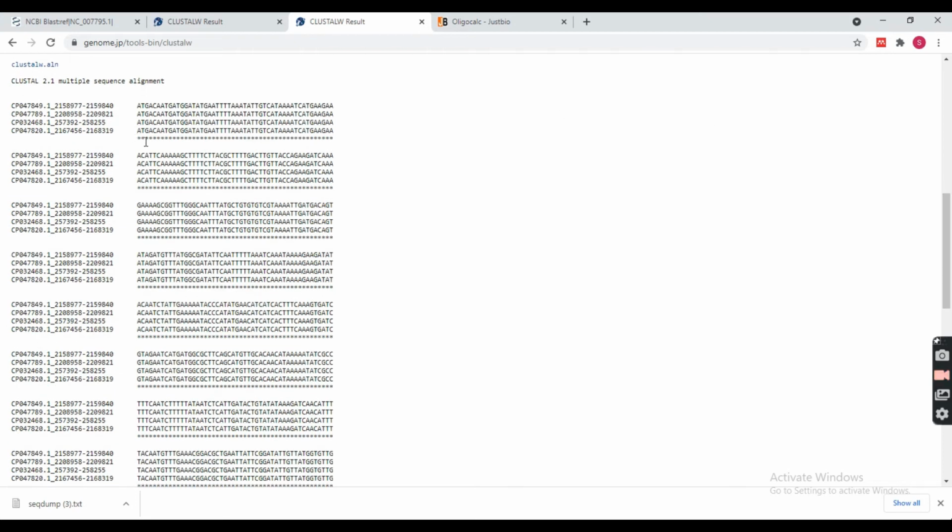First of all, you need to observe these asterisks. As these asterisks are all conserved in the whole sequence, it means here we have 100% alignment. Now the step of grouping is not necessary. You are not supposed to select from here or there. You can select from anywhere because alignment is 100%. All the regions are conserved. This was the first point that you are supposed to understand.